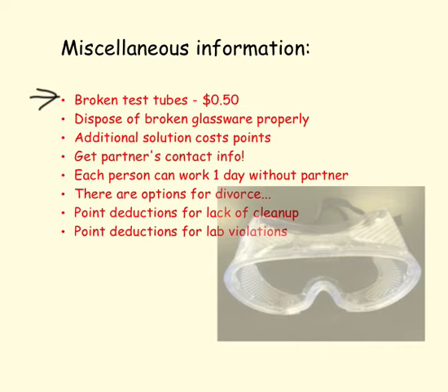It's not something you're trying to do, but we need to reimburse ourselves for that. So 50 cents for broken test tubes. Please have change available if possible. And then glassware, that gets broken at times, so make sure you know how to dispose of that properly.